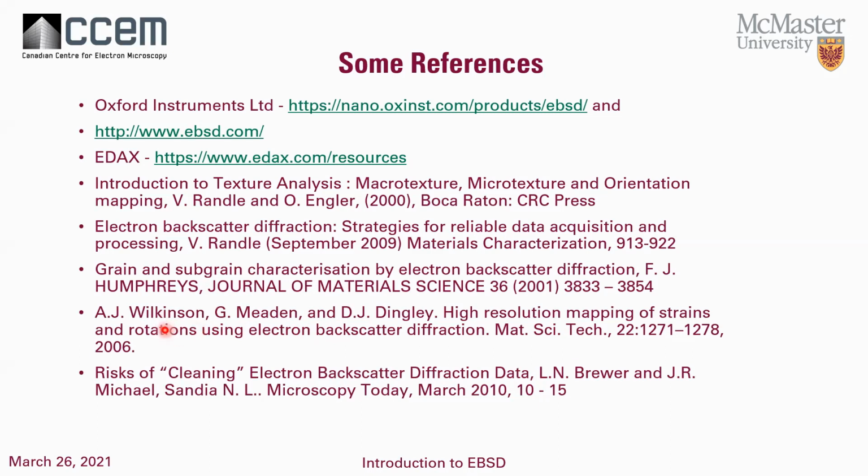Here you're getting into maybe some cross-correlation analysis of things. So actually looking at the patterns and basically determining small shifts in the patterns in order to figure out strain within the material. David Dingley is actually, I would classify as the grandfather of EBSD.